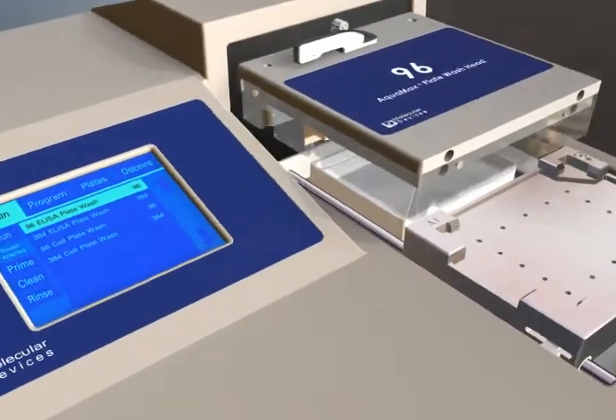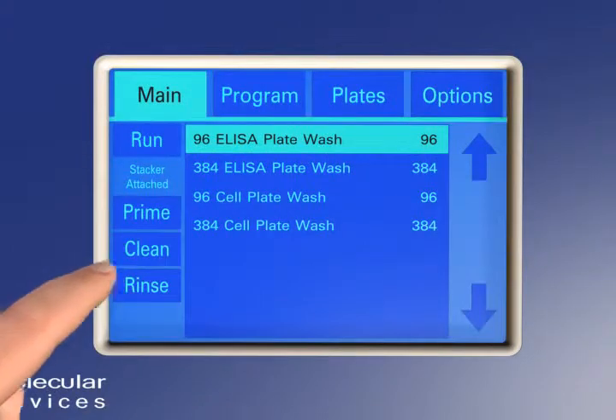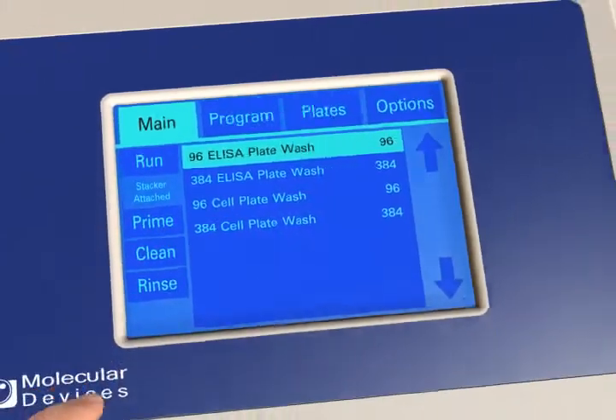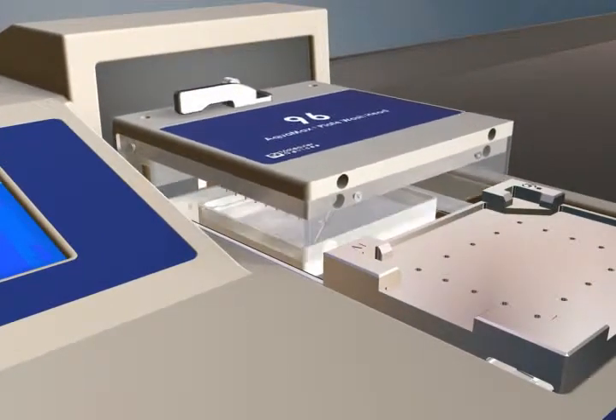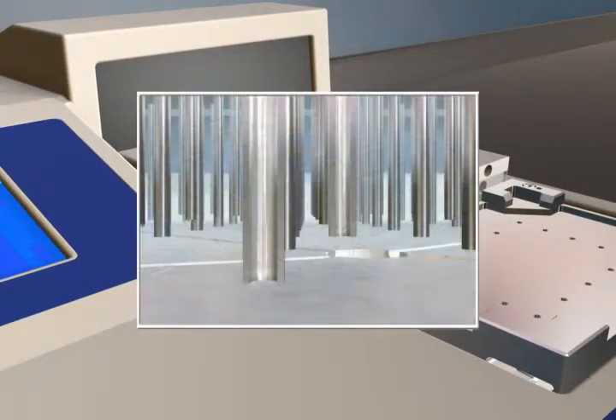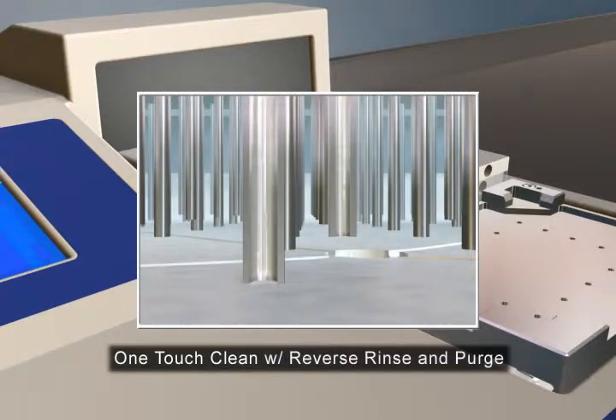Comprehensive automated cleaning programs can be set up and run at the touch of a button for easy maintenance and operation of the microplate washer system. The Clean program not only decontaminates, but also keeps the fluid path dry using the unique purge feature.